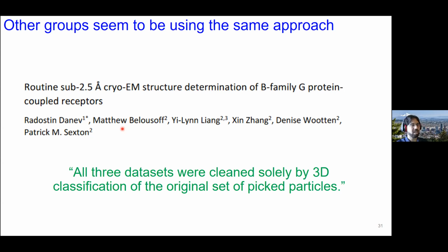To be honest, if you think about it, it also makes a lot of sense, because the ultimate goal and the incentive for 2D classification is to find similar particles, average them out, increase the signal to noise, and at the end give you good looking 2D class averages. And 3D classification's incentive is to try to move particles around and find the right orientation for the particle until it can give you the best 3D class that it can. And the ultimate goal of cryo-EM is usually not to get very good 2D classes, right? The ultimate goal of cryo-EM is to get good looking 3D reconstructions. And for that, really the incentive falls along 3D classification.